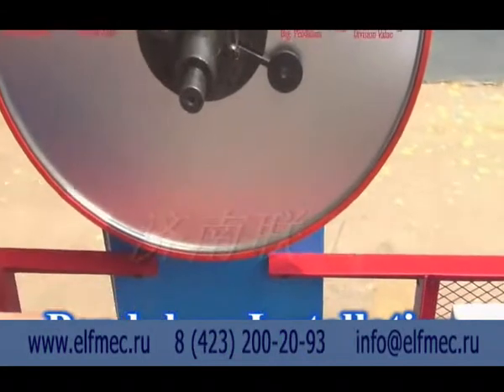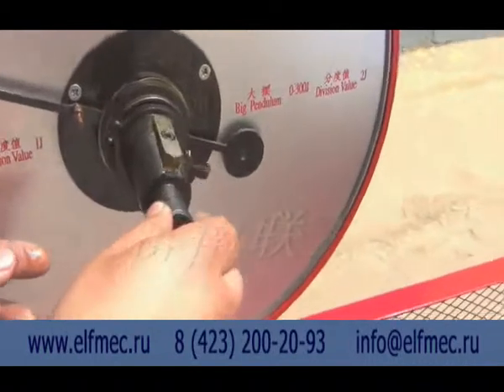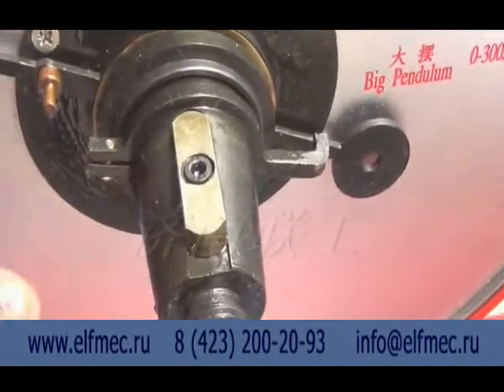Pendulum installation. Install the corresponding pendulum according to the requirement of the test. First install the pendulum, load the washer and nut, and then lock the nut.